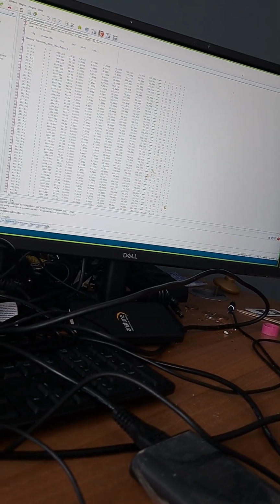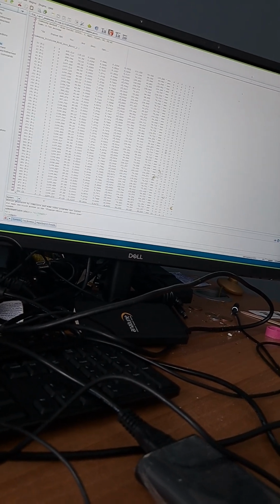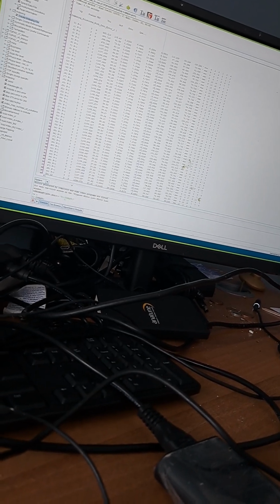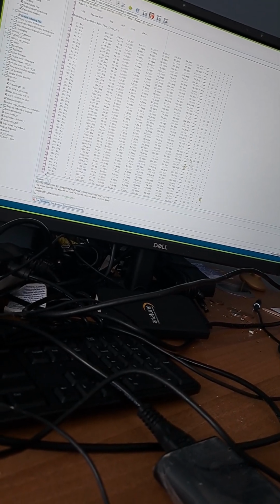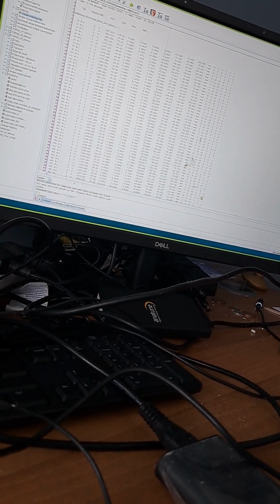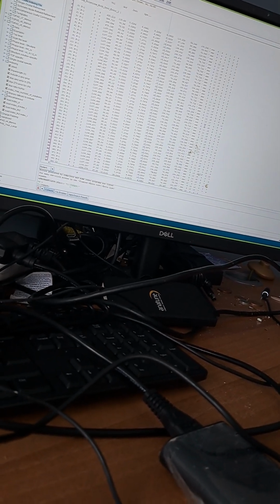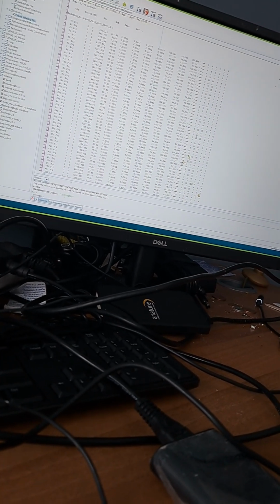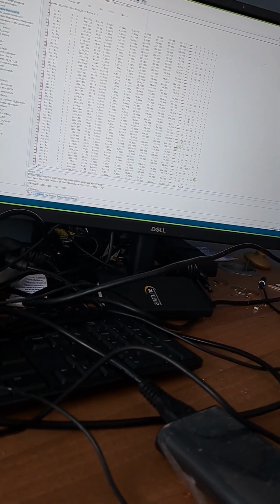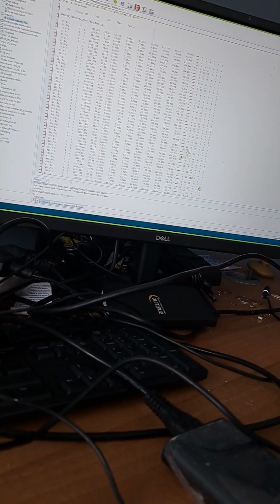Okay, so at the top there, you've got potential indexing of the sample. So that's obviously 115, goodness of fit, so that's pretty good. What's promising about these sets, these first two, is that they're similar to one another and the same sort of numbers are coming out. They're not the same unit cell because you can see that the volume's changing. But obviously it's promising anyway. So what's the volume that we need?